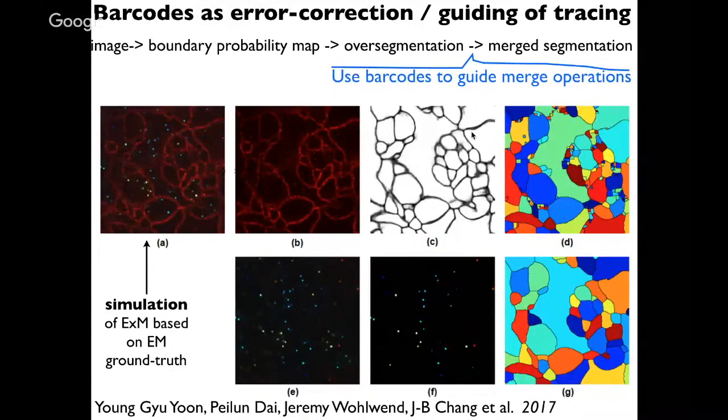Once you've identified those putative boundaries, you can do a segmentation operation called a watershed, to try to find what are the contiguous regions that are bounded by that boundary map. But what that tends to do is to over-segment and create lots of little mini pockets that really should be identified as part of the same neuron, but instead is identified as its own little contained boundary.